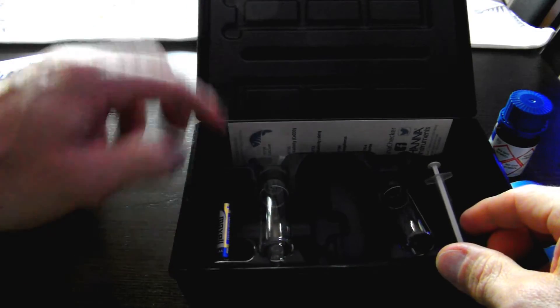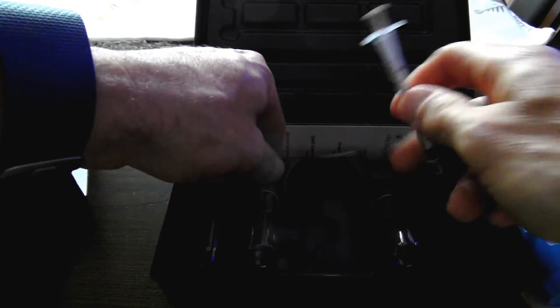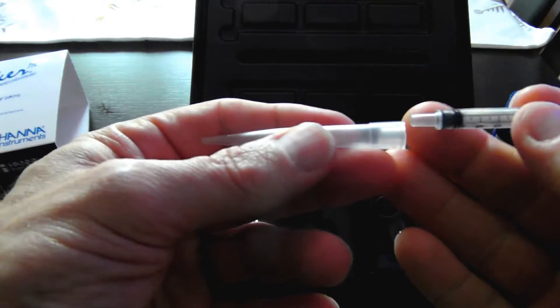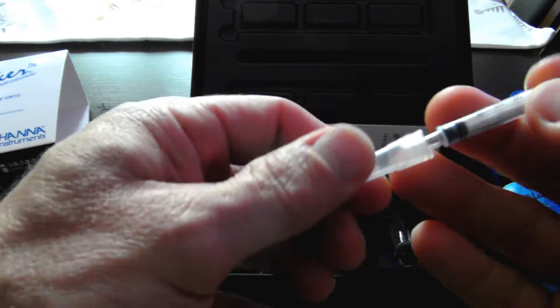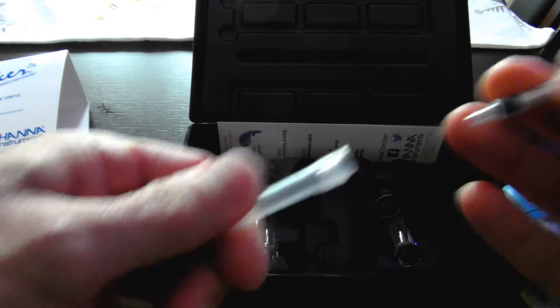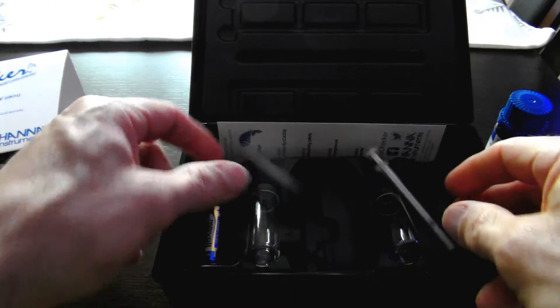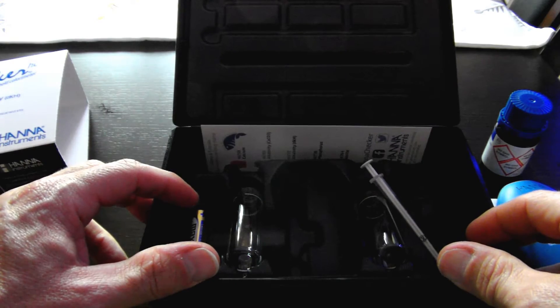Got the battery, syringe, looks like it's one milliliter and maybe a tip for that syringe. So let me get the battery in here, power this on and see how it goes.